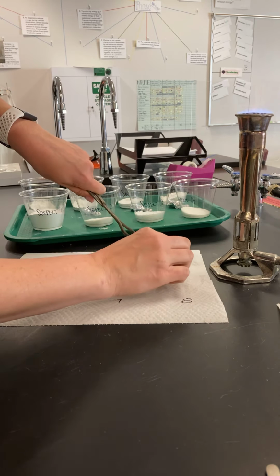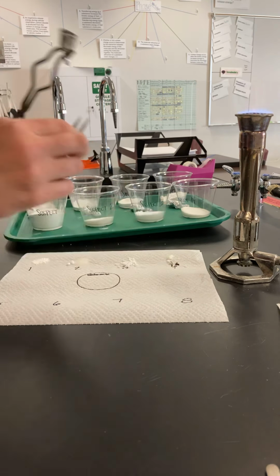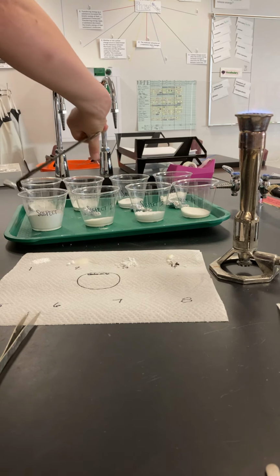You guys can kind of see that glump of almost black tar, and you guys can see where it kind of started to turn yellow where it started to melt. If I smell that, it almost kind of has a burnt marshmallow smell to it. Kind of a sweet smell. Okay, so that was substance 4. And again, I'll zoom in on these so you guys can see them a little bit better.